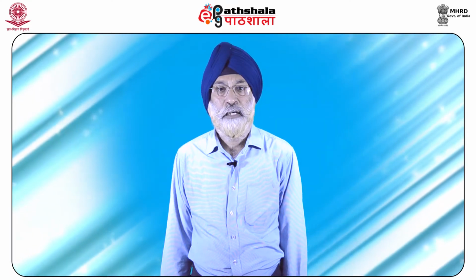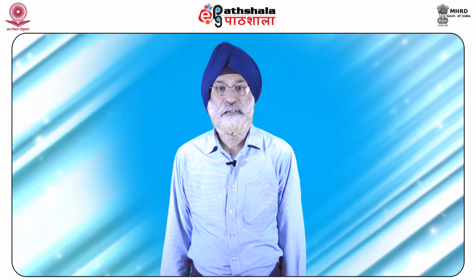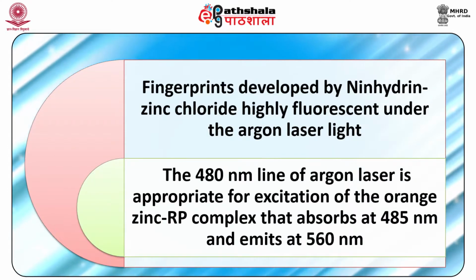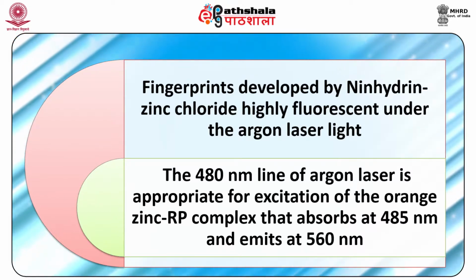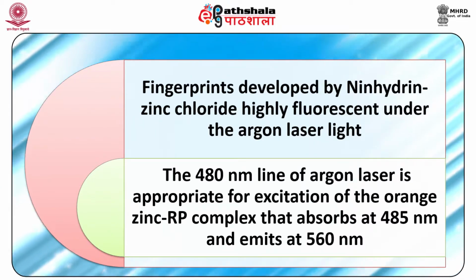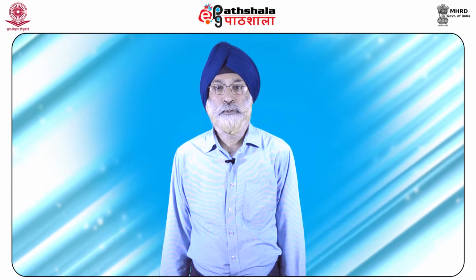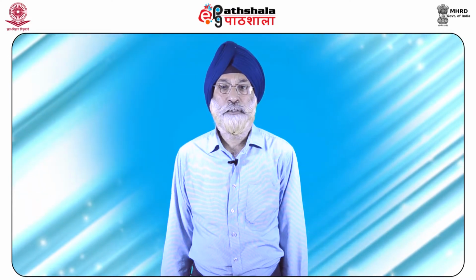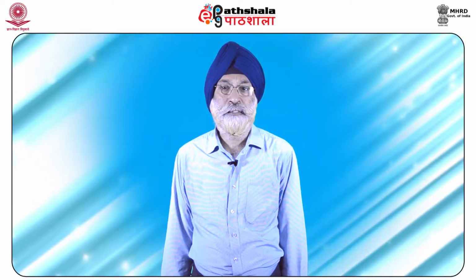Laser excitation enables detection of very old prints after these have been developed with ninhydrin and post-treated with zinc chloride. Fingerprints developed by the ninhydrin zinc chloride method become highly fluorescent under an argon laser. At 480 nm, the argon laser produces appropriate excitation for the prints to become fluorescent. Further, with zinc chloride post-treatment and argon laser examination, the laser method may be extended for detection of fingerprints even on non-porous surfaces like glass, plastic and metal.